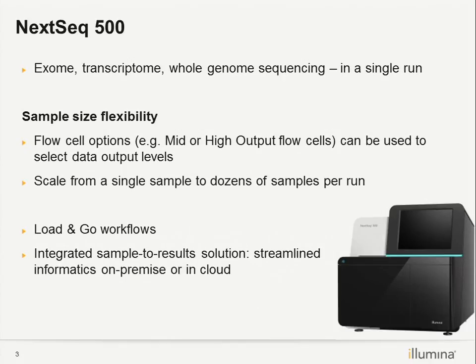Is the index stored with the read? The index will be found in the FastQ files, with each read. Any more questions? Right, thanks a lot for the good questions.